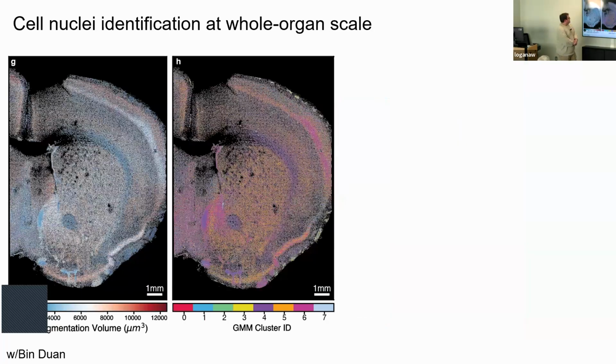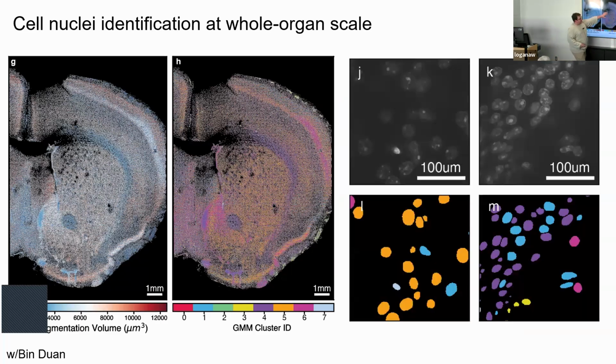Yeah. So to demonstrate what we can do with this bioinformatically, on the nuclei channel, the DRAQ5 channel that was in that image, we trained and ran an nnU-Net model on the raw imaging data to do segmentation of the individual nuclei. So here are the nuclei. This is showing you what the segmentation mask looks like. And then using these segmentation masks, we ran a bunch of quantification on their 3D structure, 3D shape.